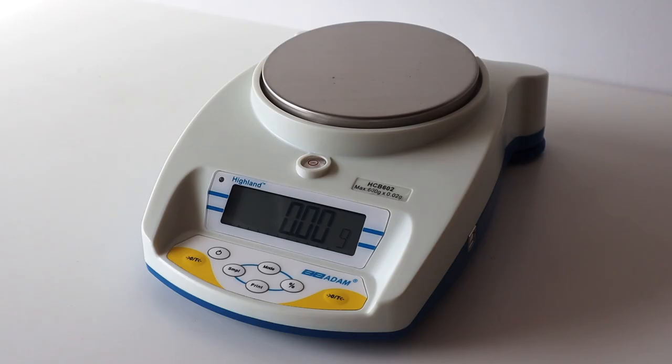To find out more about the Highland Precision Balance from Adam Equipment, and how to use its many functions, download the user manual, or give us a call.